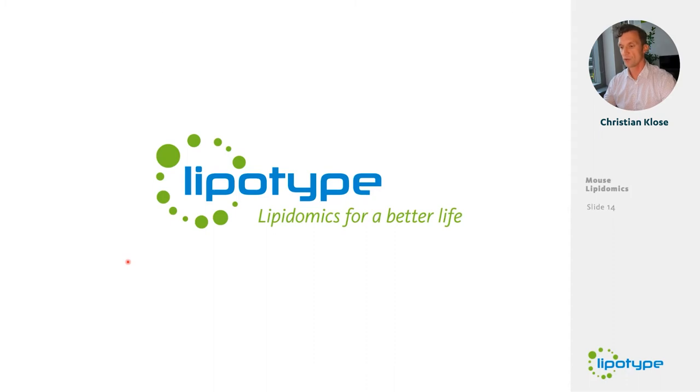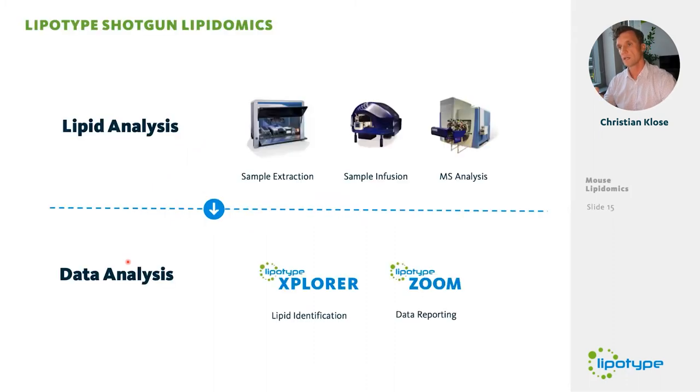It comprises basically two essential parts. Part one is the lipid analysis itself, which typically consists of a lipid extraction done with mostly organic solvents, depending on the sample type, different mixtures of chloroform and methanol. This sample extraction is usually done in the 96-well format using different pipetting robots. So it's a fully automated process. Once the extracts are collected, they are directly infused into the mass spectrometer for analysis. And for sample infusion, we use this little device here. It's a nano electrospray ionization source, which allows us to infuse the lipid extracts from our samples in a 96-well format directly into the mass spectrometer.